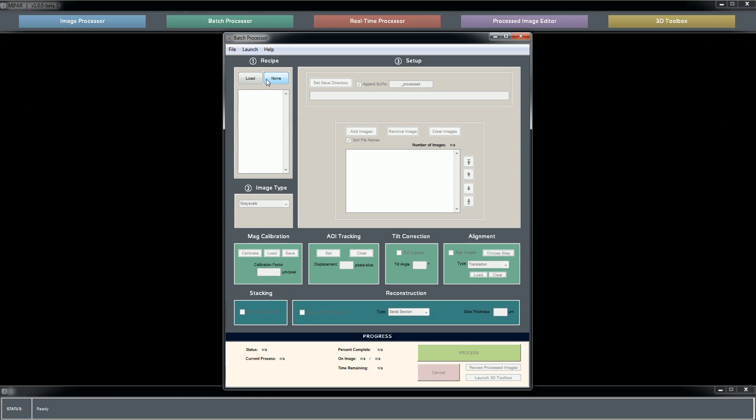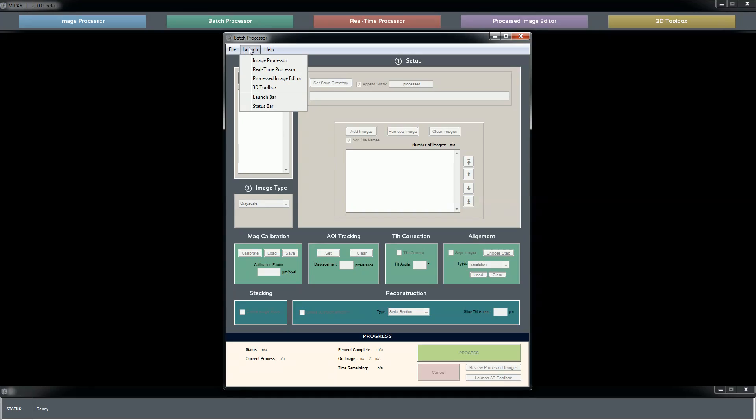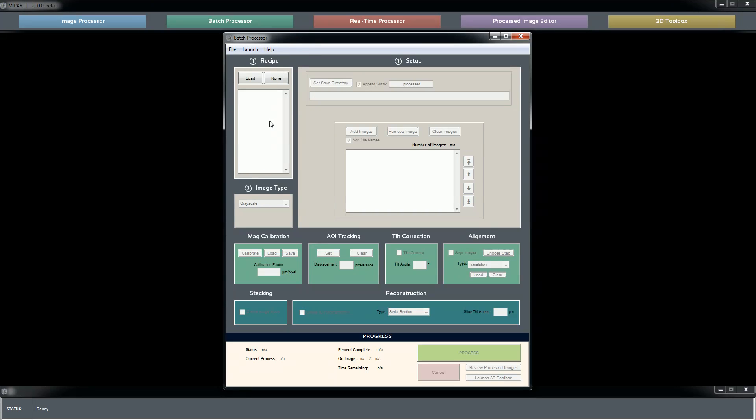Let's take a quick look at the batch processor. Again, a small menu bar up top, common features throughout all applications. Here's where you'll load in a recipe if you intend to apply it to a number of images, select the images to process, choose where to save them. And a lot of these other options are relevant to making a 3D reconstruction and will be covered in that tutorial. And then the progress report as the batch is running appears down here.